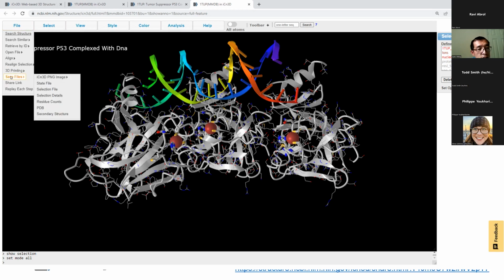Now, ideally, if you work on the same website, you can put it on your web server, and then you can click on that file on the web server. So that's something that definitely we need to improve, so that we can make longer analysis shareable. Right now, 4,000 characters is the limit.